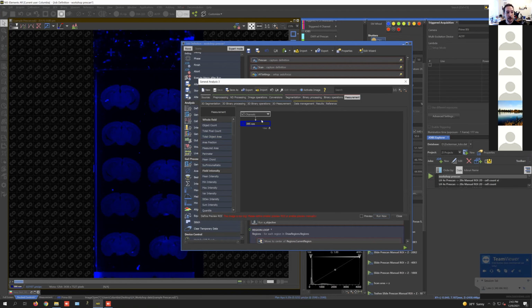So just getting back to the example at hand, we have this fluorescent channel and we want to detect the tissue sections. And the way that we can do that, we can use our segment AI that we've already trained. And I'm going to show you how to train this too in the workshop. Okay, so it's in here, it's this one just here. And the way that this works is quite intuitive actually. These just connect together like nodes.